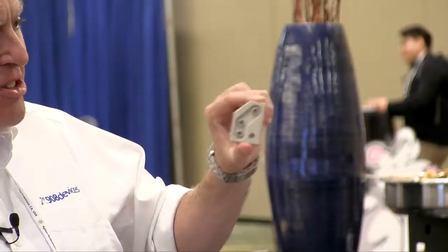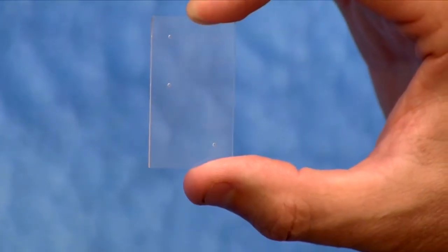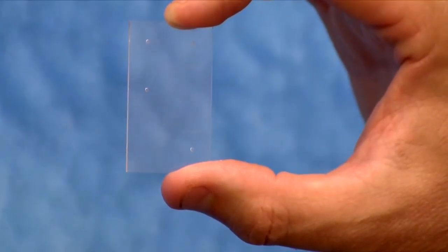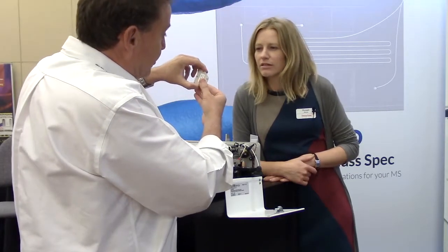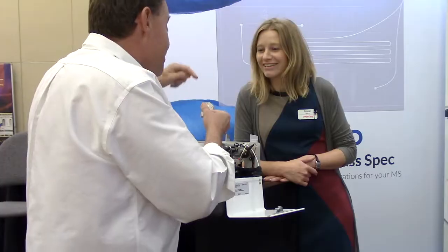So this is the cartridge with the ZipChip in. But this is the chip itself — you can see there that it's etched glass. On this one you have a 22 centimeter channel and that's where the separations occur. This actually acts as an electrospray, so that's where you actually electrospray into the mass spec. That's really cool.